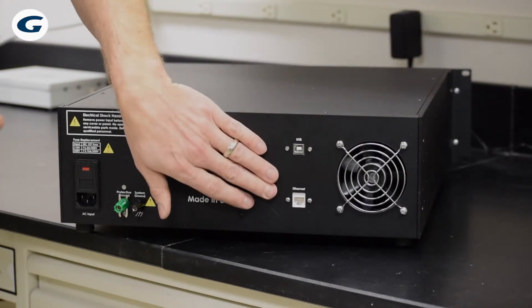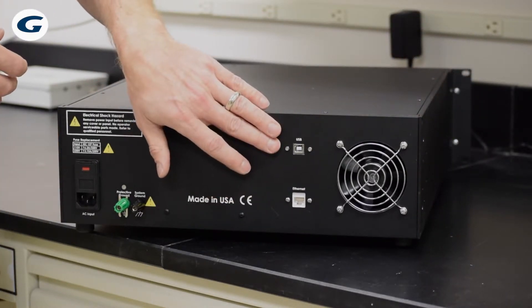Here on the back we can see both Ethernet and USB, so if you want to connect it directly to a computer or you want to connect it to a network and access it from a control room further away, you can do that too.